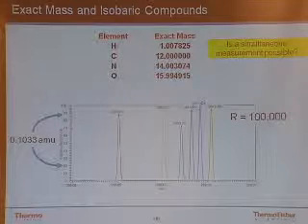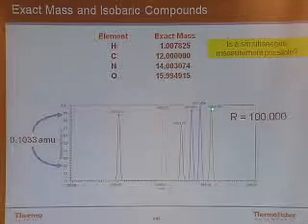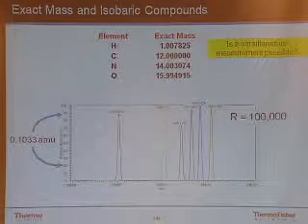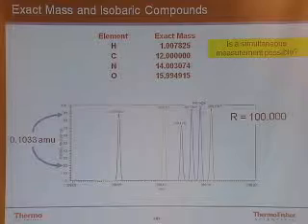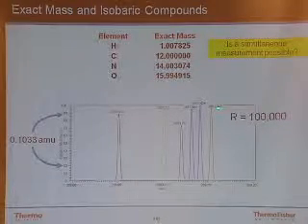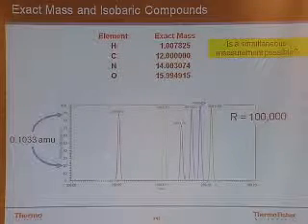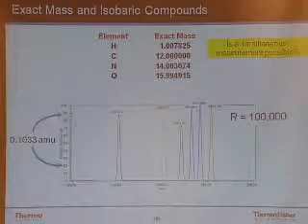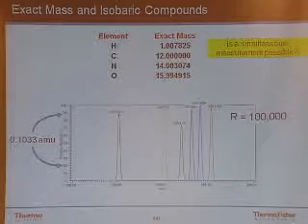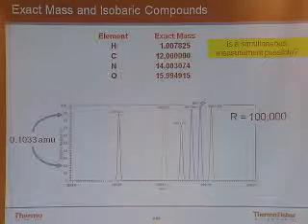For example, if you're up closer and you look in your notebooks, this last peak out here, the mass spectrometer says I have a molecular weight of 289.1547. Now, if I go back and I calculate the exact molecular weight, actually the exact molecular weight of that peak is 289.1552.